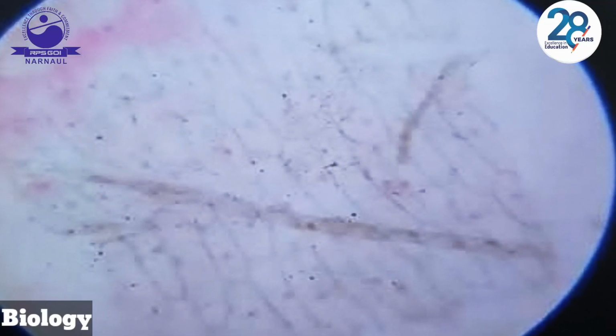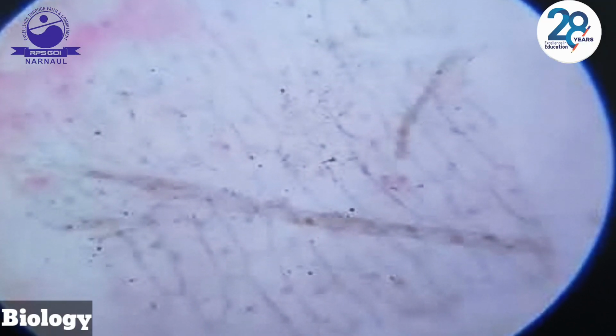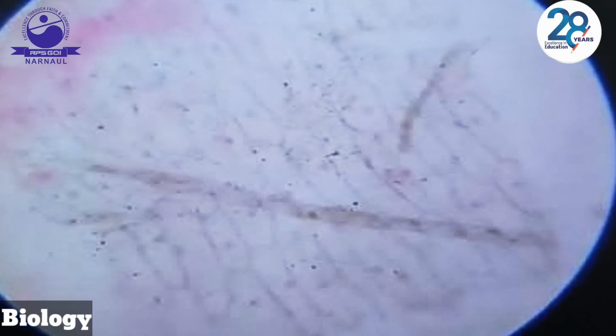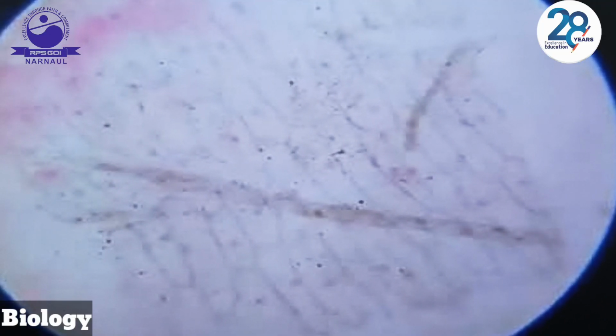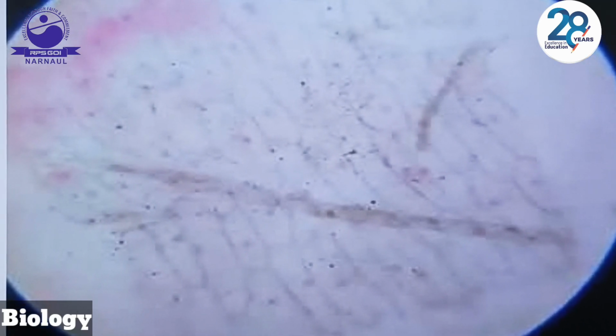Parenchyma consists of thin walls. The cell wall is made up of cellulose. They have a distinct nucleus. The black dots are visible, and these are the nuclei. They have a large central vacuole.